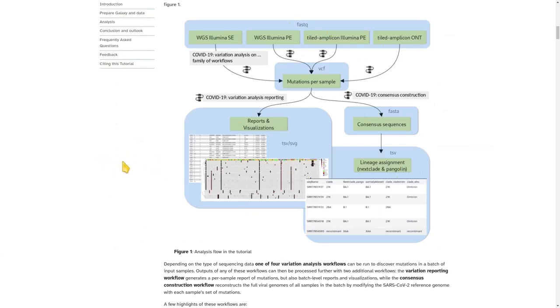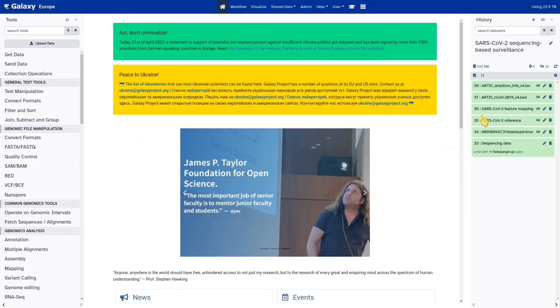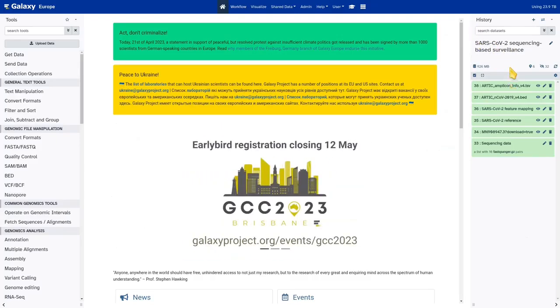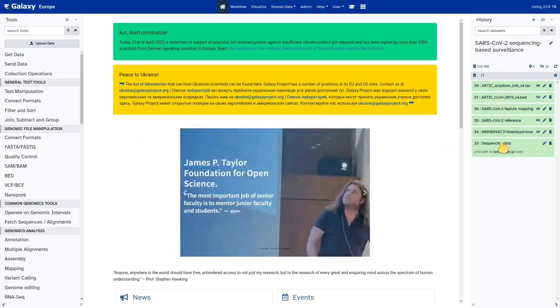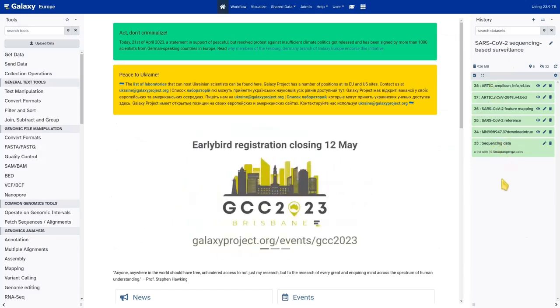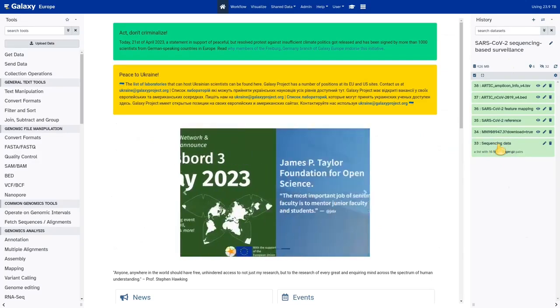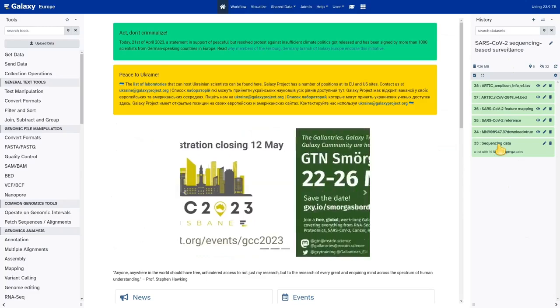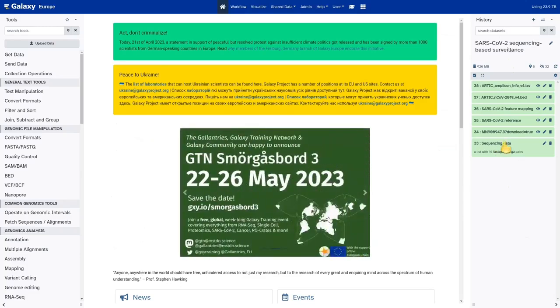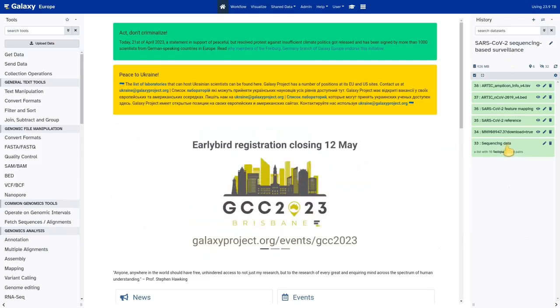I've already set up my analysis history — created a new history, named it, and followed the tutorial instructions to upload all necessary input datasets. We're going to analyze a batch of very early Omicron data, in fact the first batch that came out of South Africa at the end of 2021.